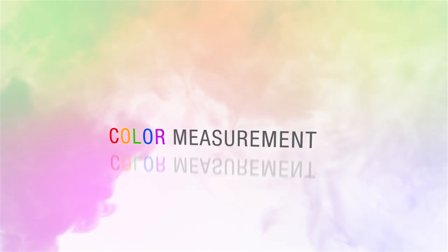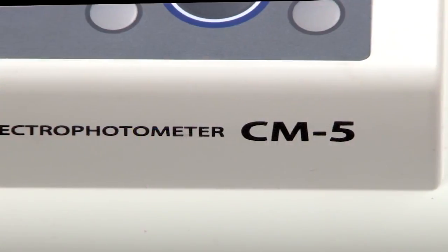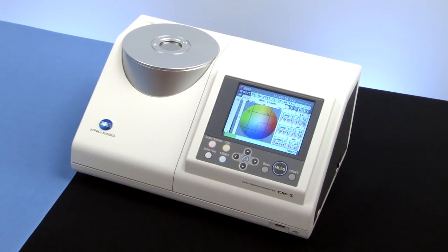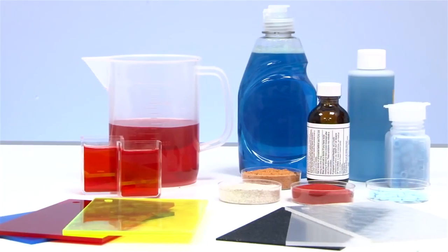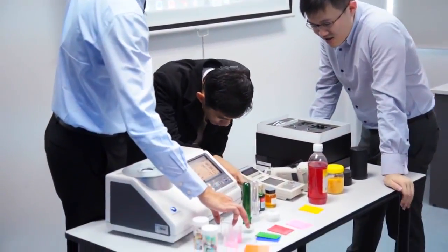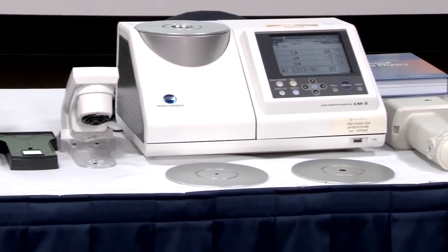Konica Minolta Sensing, the leading manufacturer of color measurement instruments, offers the CM5 Benchtop Spectrophotometer, a vital tool in research and development, quality assurance, and laboratory testing. Used by top companies all over the world, the CM5 takes the guesswork out of color evaluation.